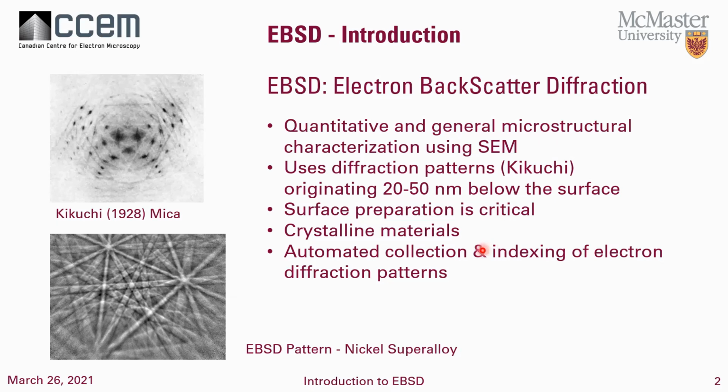And with the advent of various technologies, such as improved computer processing, we can now do automated collection and identifying, or indexing, of these electron diffraction patterns, or Kikuchi patterns.